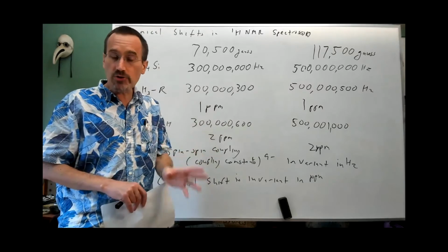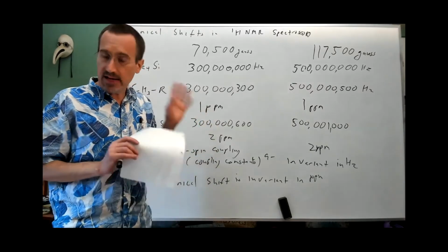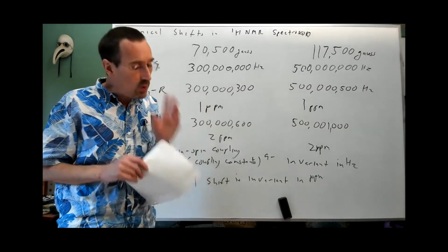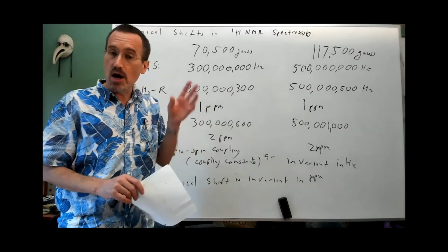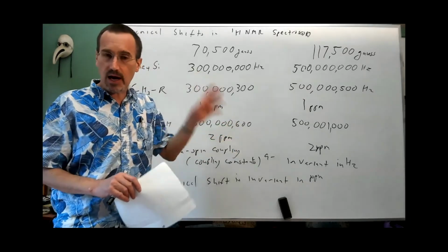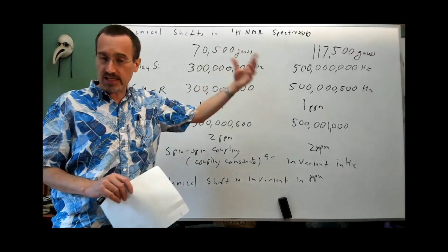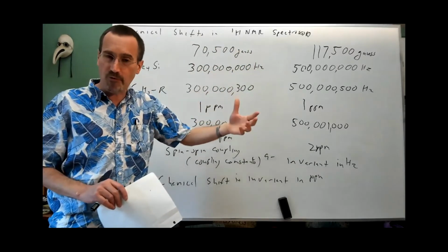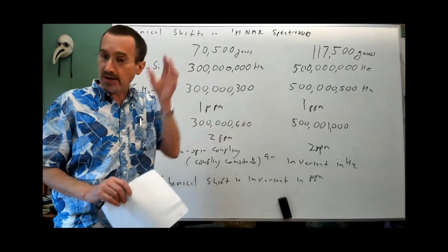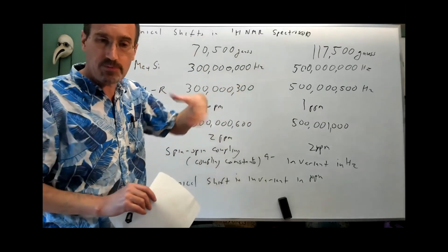It assures you that when you draw a molecule out, or look at a spectrum and think of a structure, you can quickly and critically say, oh, wait a second, no, it can't be that structure, because an ethyl group next to a ketone would have its CH2 at about 2.4 parts per million, but the CH2 here is at 4.1 parts per million.